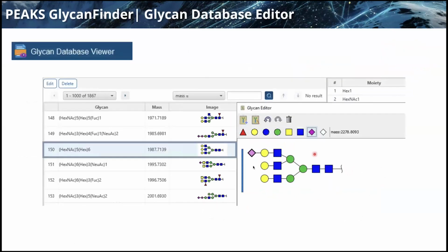And one last thing that is helpful, talking about this de novo sequencing: in our glycan database viewer, which is essentially an editor, you can pick any of the already existing structures, or you can create a new one, and easily edit and add any glycan needed. So this way you can easily customize the database. It is also possible to add glycans in a text format directly into the configuration. It has to be a glycoCT or GDP structural format though.